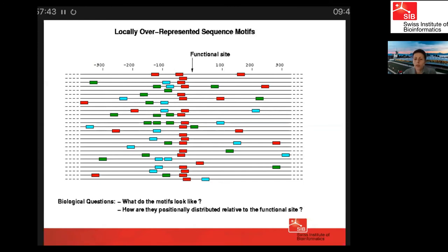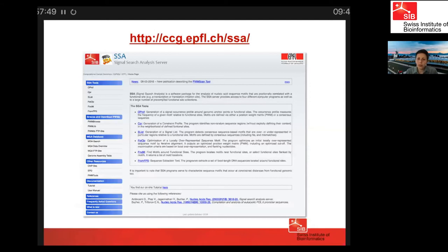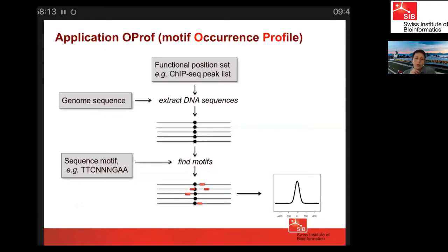This is the SSA web interface, which looks similar to the ChIP-seq interface — from the left side menu you access tools and documentation. Today we will use OPROF, which stands for motif occurrence profile, for our motif enrichment analysis. OPROF takes as input a functional position set with peak positions, extracts sequences around these peaks, and also takes as input a sequence motif that can be described as a consensus sequence or as a position scoring matrix.